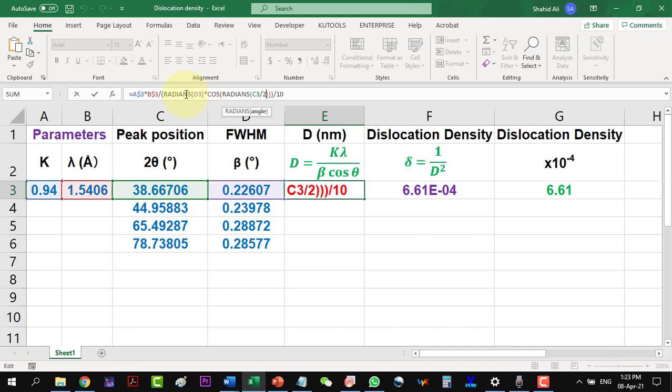We are having two theta values here. So I will have to divide it by 2 to get theta. As Excel by default calculates the trigonometric functions in radians, so we will take radian beforehand to finally get the value in degrees.